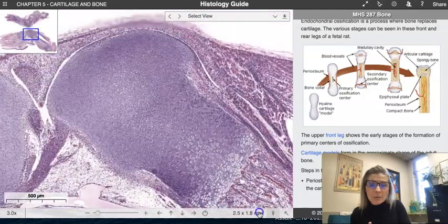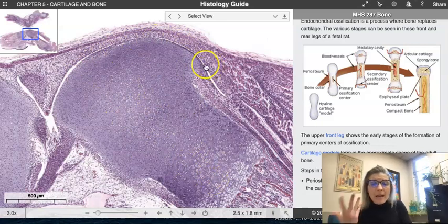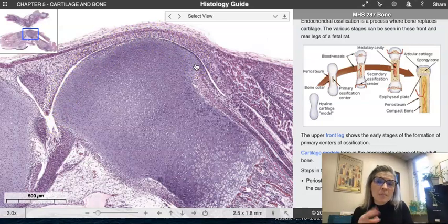right, at the ends of the epiphyses. So you'll have a layer of hyaline cartilage here. All of this will essentially transition to spongy bone as an adult, but you will have a layer right along the surface of hyaline cartilage, which we rename as articular cartilage, because that's where your bone would rub up against another one. We need a smooth surface, not pliable, but a little bit spongier, and the hyaline cartilage will provide that.